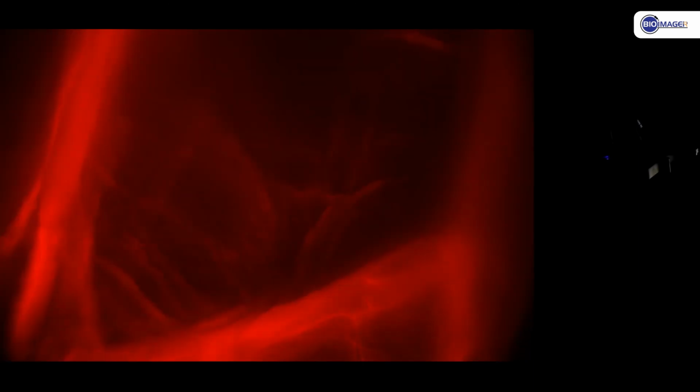Next is blue excitation and green emission. And finally we have green excitation, red emission.